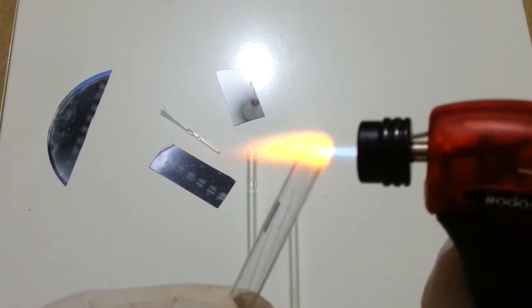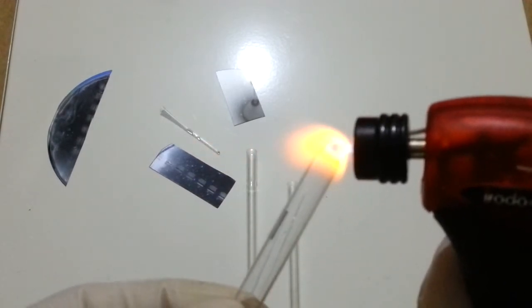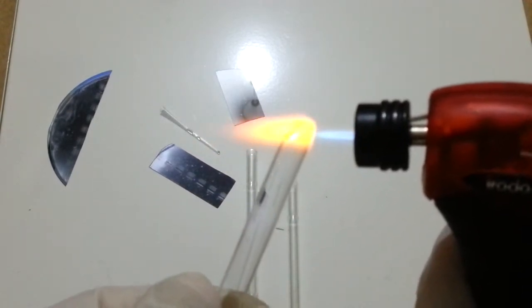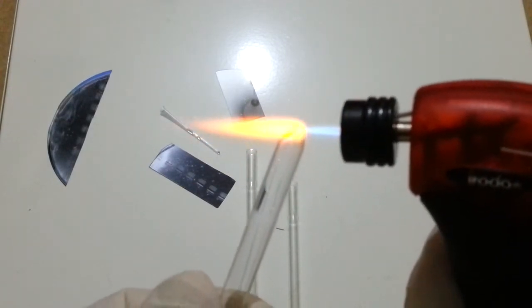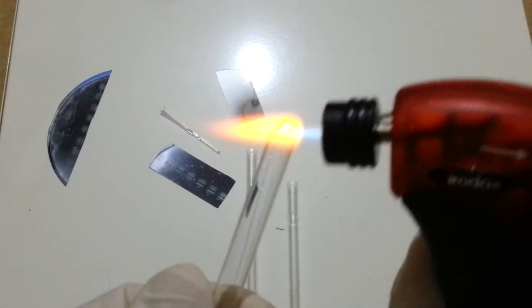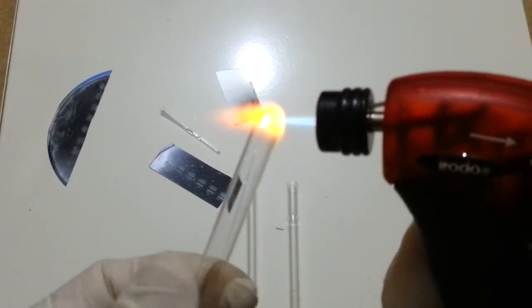The orange flame indicates that the glass is starting to melt. The orange color is due to the presence of sodium ions.